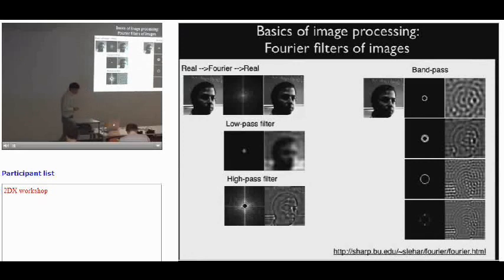So now we are getting into manipulating images. One of the fundamentals in image processing is to apply low-pass filters. I spoke about this before, and now it's on a real space image. There you can grasp that if you cut off all the high frequencies, you can easily discern the overall shape, but of course all the details, the eyes, are lost.